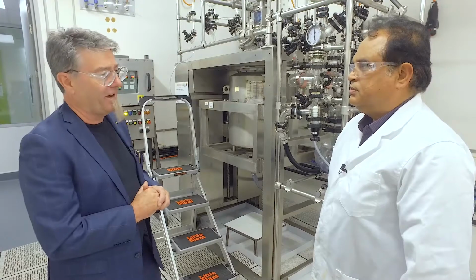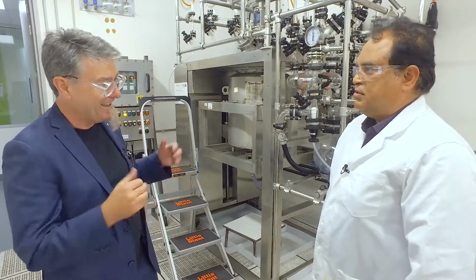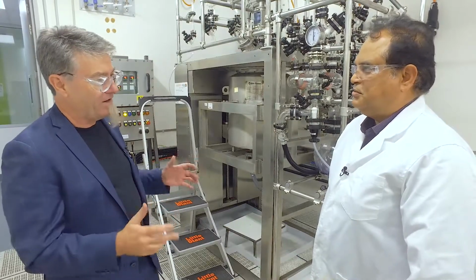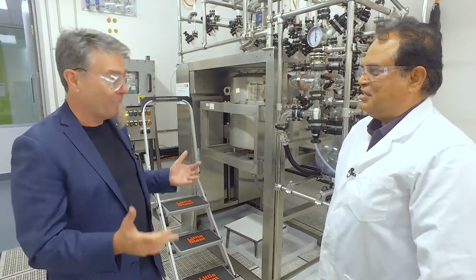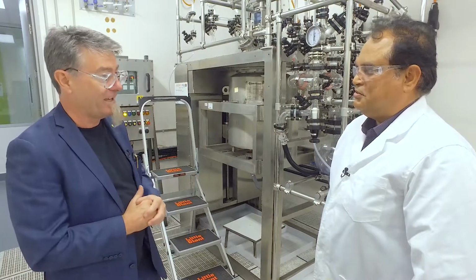Great. Well, we're going to go and have a look at some of the different fabrication methods, the fibre spinning and the printing and the making of all of these amazing devices for energy and biomedical applications. So thanks to you guys down here for showing us what we do at a very fundamental level in the chemistry of graphene and how we make it scalable. Thanks. Thank you.